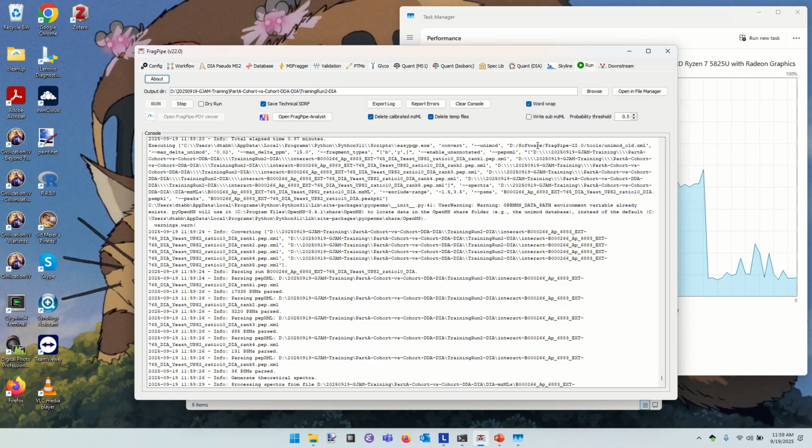We've now parsed the information, converting it, blah, blah, blah. We're going to get there, I swear. Yeah, for me it finished, I don't know, 10 or 15 minutes ago. In 20 minutes. Oh, yours finished already? We should plug her into the screen. Your total run went 20 minutes. That's very nice. Congratulations. I was compressing H.264 video at the same time as I was doing this, so yeah, let's chew into it.